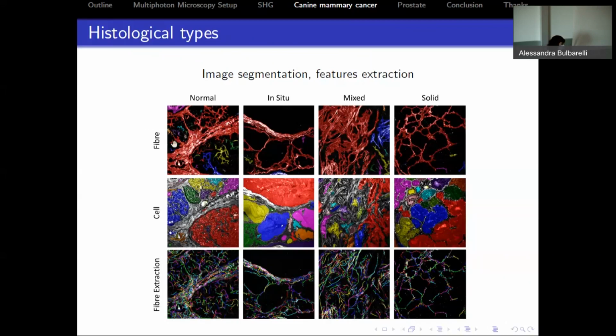So say in this cellular matrix in this area, which is well and nicely connected. And then within the gland area, we have smaller networks, but they are well-behaved networks because the cellular regions there is just the normal healthy tissue.